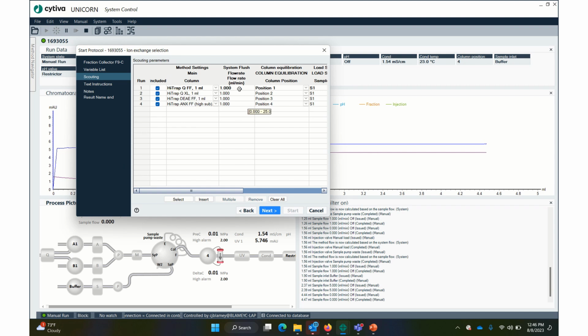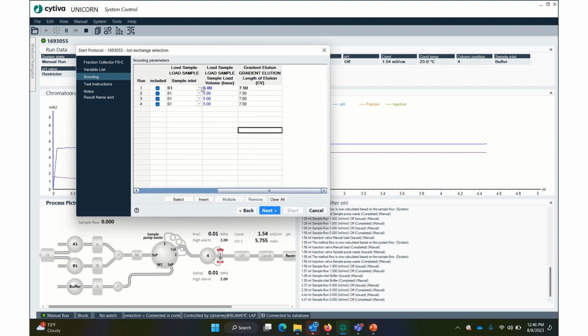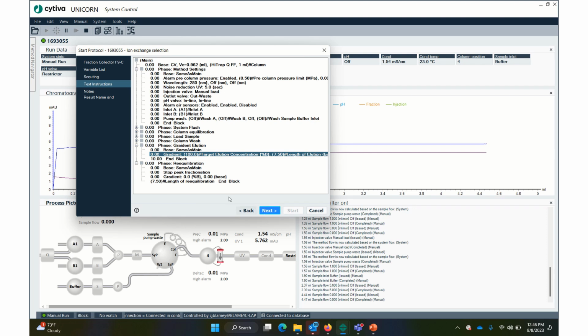So, system flush, 1 mil a minute. We're just going to review, right? That's what we're doing. System flush, 1 mil a minute. The sample load position right here is S1 the entire time. We're going to do every single run, load 5 mils, and we're going to have a CV of 7.5 column volumes each time. That looks great.